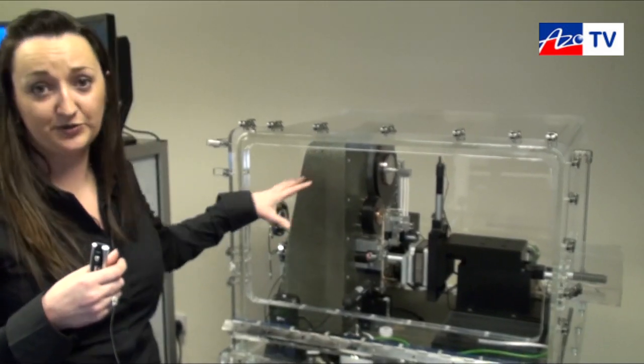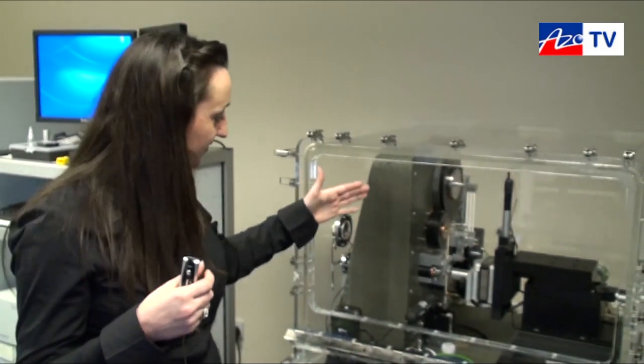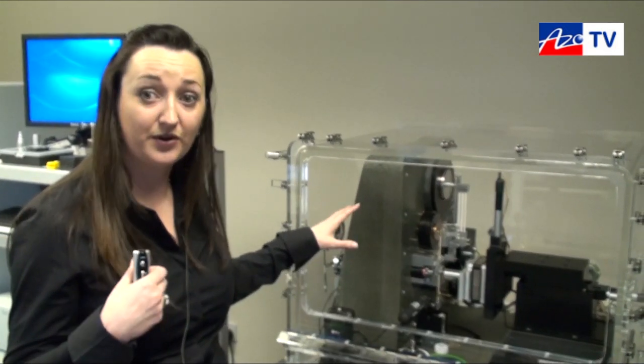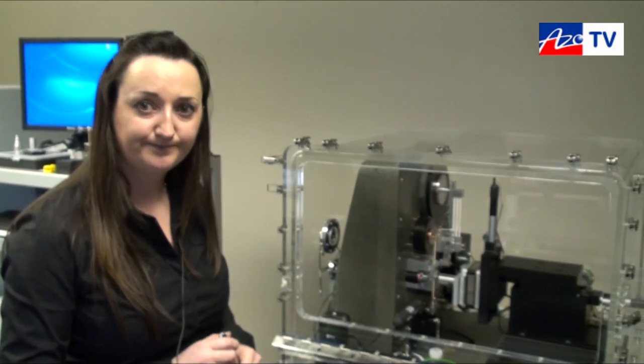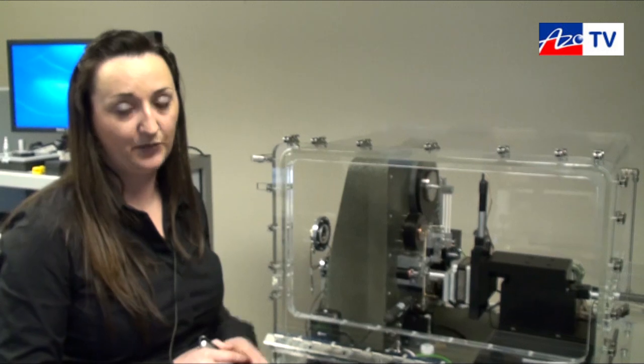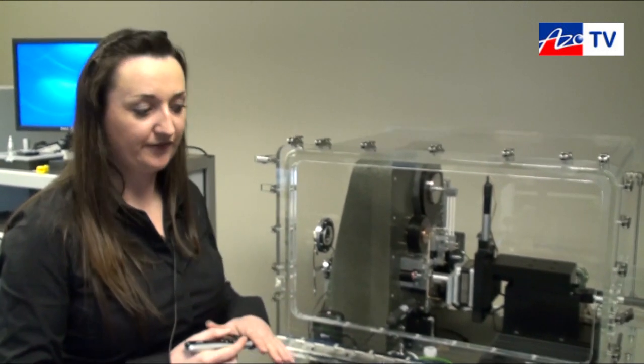So because we mount so many different things on our instrument, it's a multifunction instrument, we have to have room for lots of different things and we find this material very easy to work with actually. Now what's the maximum temperature range the instrument can work through? So we can currently go up to 750 degrees C and we can go down to minus 20 degrees. So we've got a full range there.